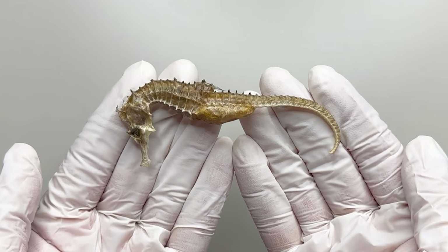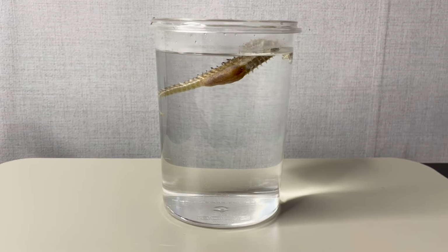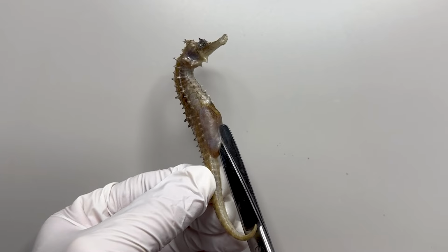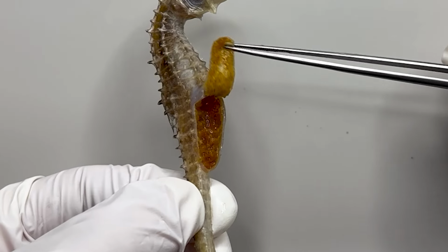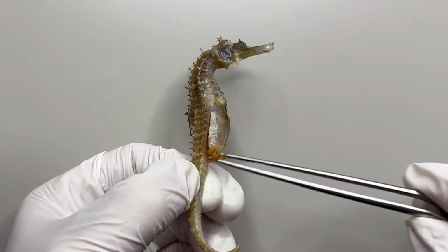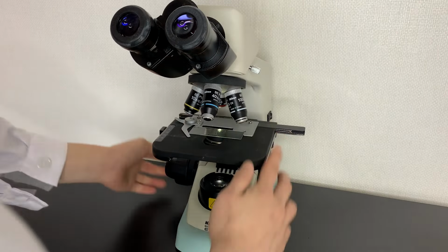This is a dried seahorse. I soaked the seahorse in hot water for about 10 minutes to soften it. Then I opened its belly and found a bunch of stuff inside. Looking closer and using a microscope, I discovered something quite surprising.